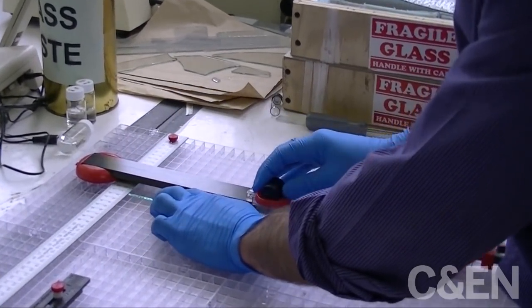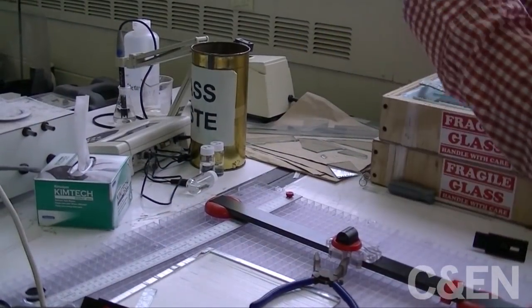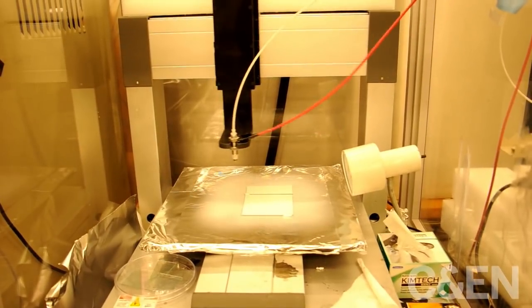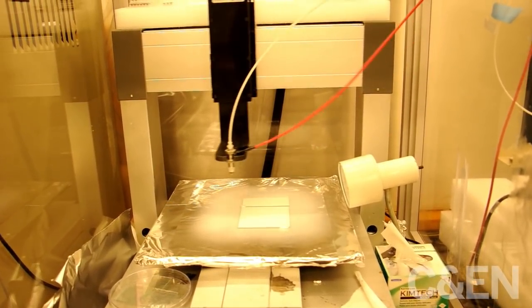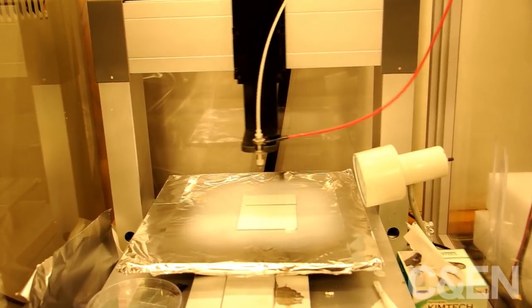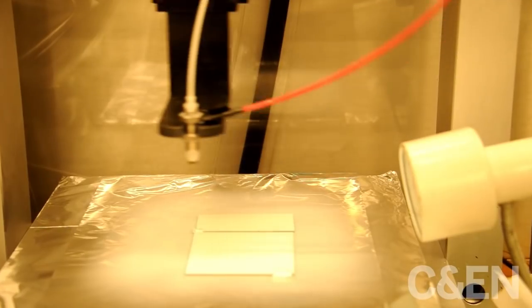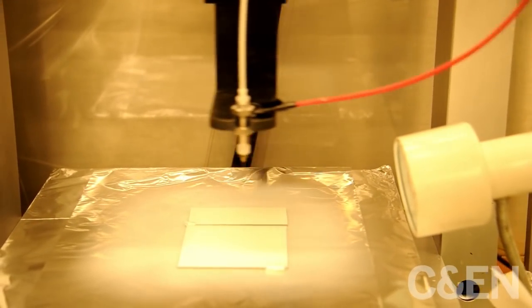This particular lab first treats the coated glass with a dense layer of titanium dioxide to prevent electrical charge generated by sunlight from leaking out of the cell. This robotic arm forms that layer by spraying a titanium dioxide solution onto the glass.